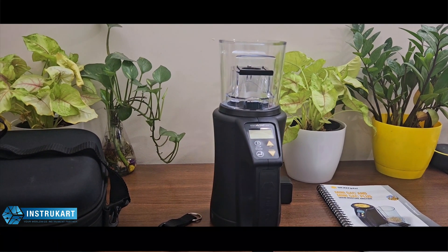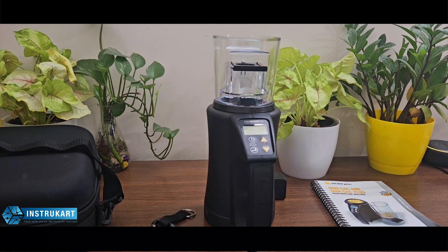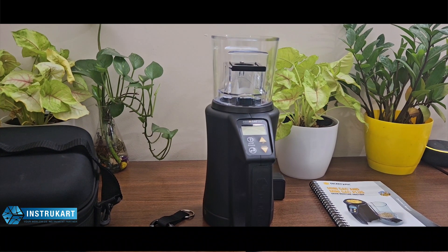Hello and welcome to InstruCart, your worldwide instrument partner. You have got a very advanced grain moisture meter which is offered by Dickey-John.